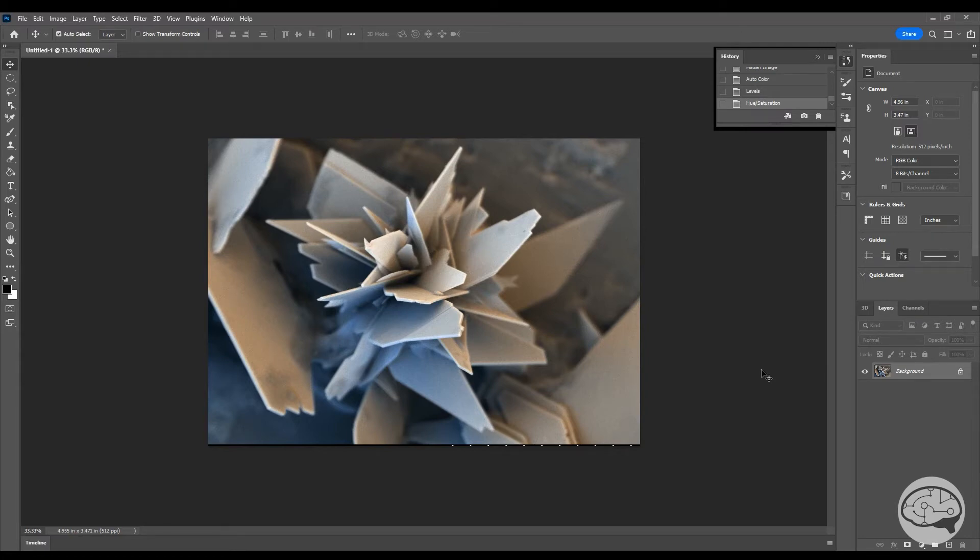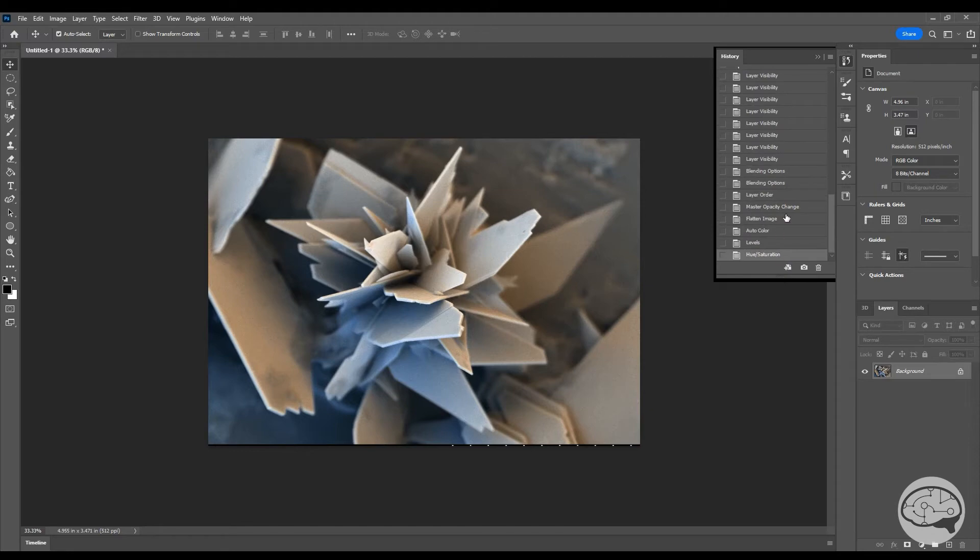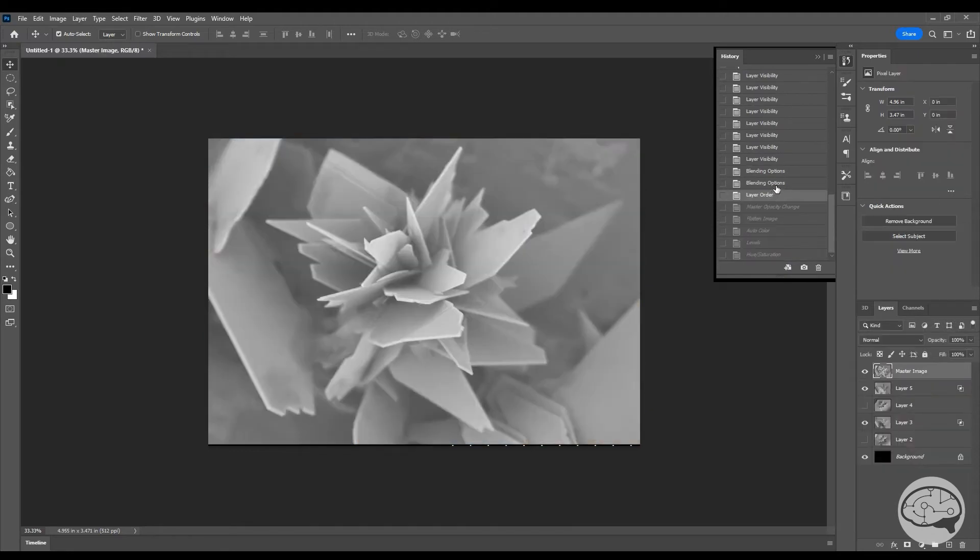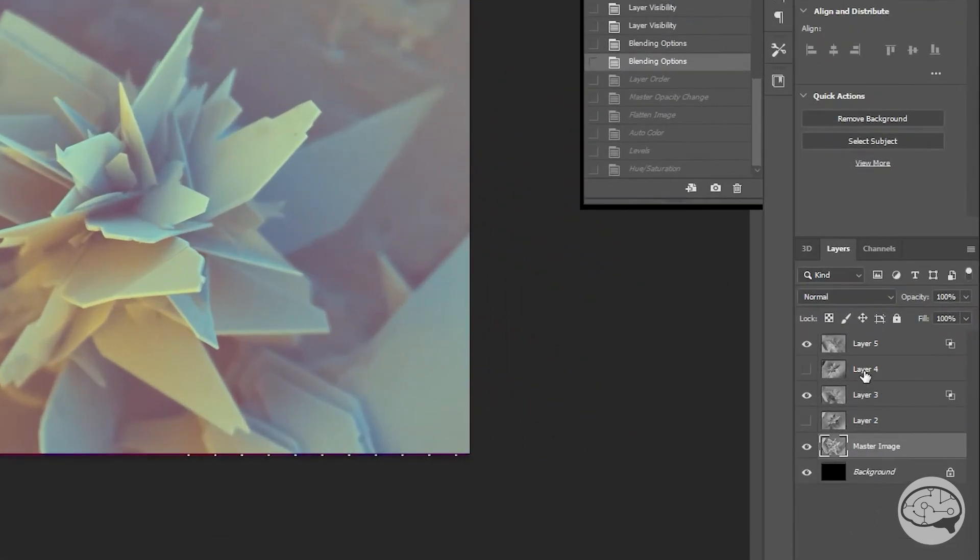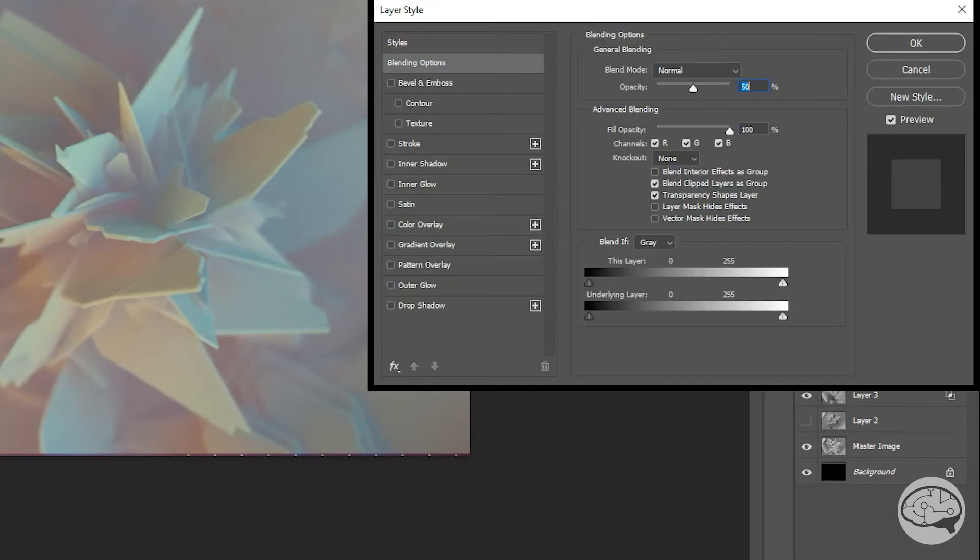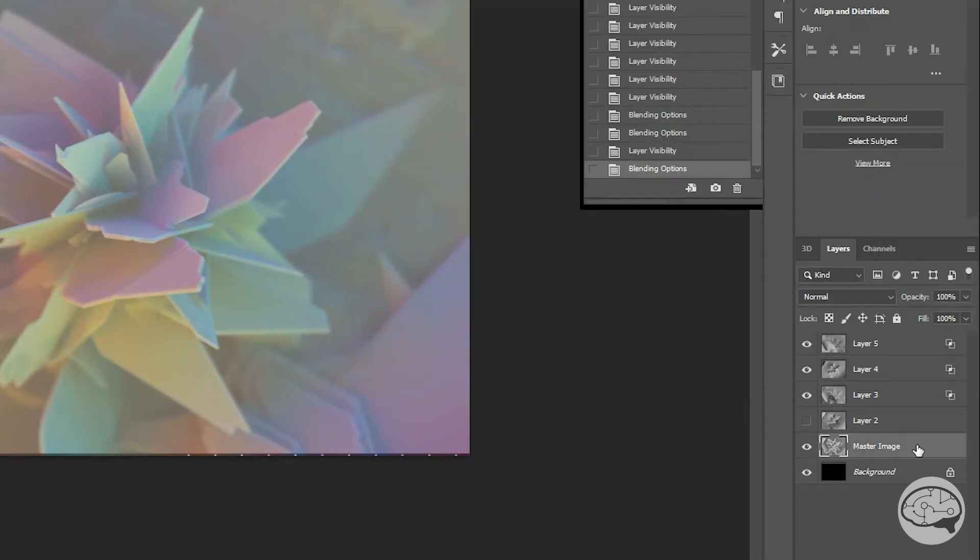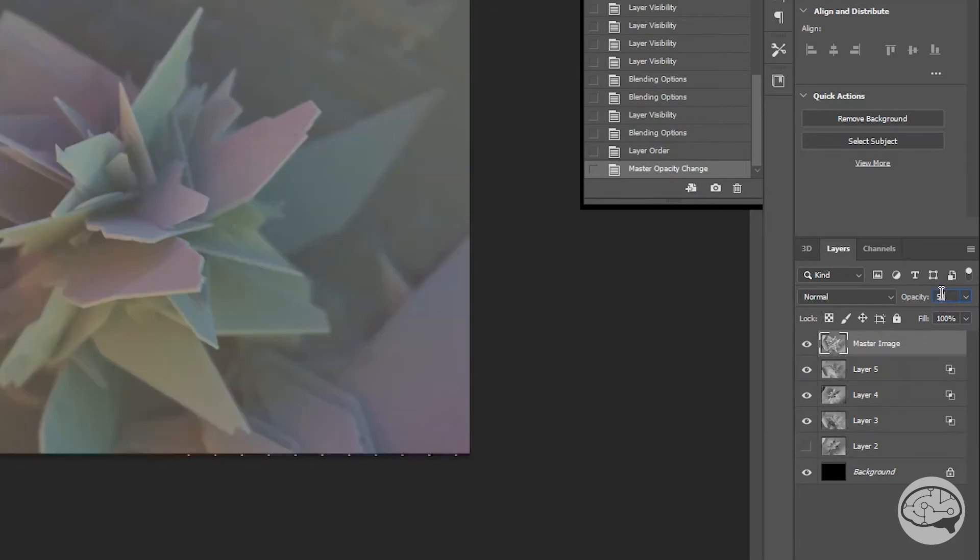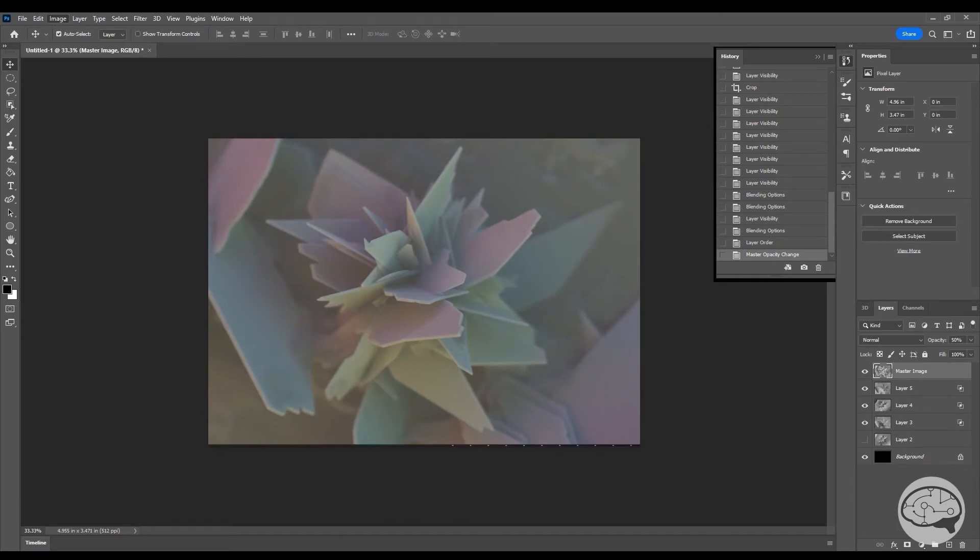Now, as I mentioned earlier, there are a lot of options that we can explore with this technique. What I'm giving you is my basic streamlined workflow. But as you can see, there are tons of things that we can tinker with. One of the most obvious ones is by adding an extra color layer into the image. So let's try that and see what happens. Backing up a few steps, let's include this layer in with the image and make sure a different set of color checkboxes are checked from the other layers. We can also have two colors checked here if we want. We just want to make sure that all the layers are checked differently. So we can see that this gave our image more colors, obviously, but sometimes more colors just make things too busy and ends up being kind of an eyesore. But sometimes it really helps.